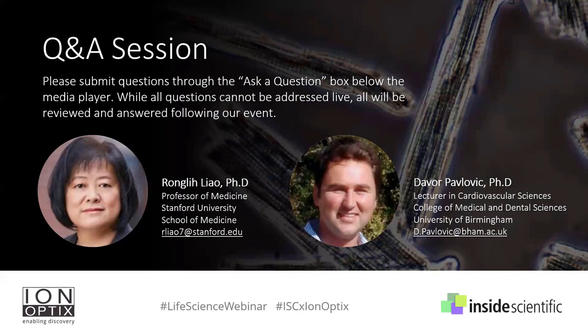Yes, of course. So I think knowing when the digestion is completed has a lot to do with one's experience. If you are using an inline pressure transducer or flow probe, you will know that either the pressure will drop or the flow will increase because the heart becomes softer. The other most common way is to gently touch the heart, and it will become very soft to touch and also a little bit transparent because now it is completely digested.